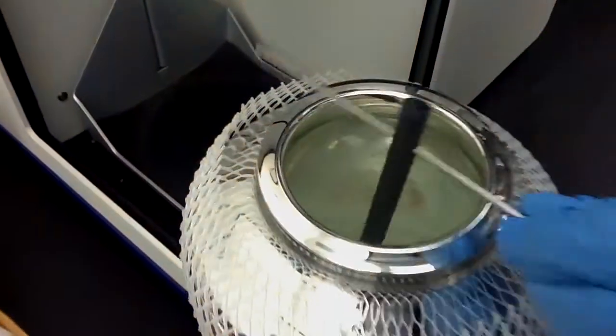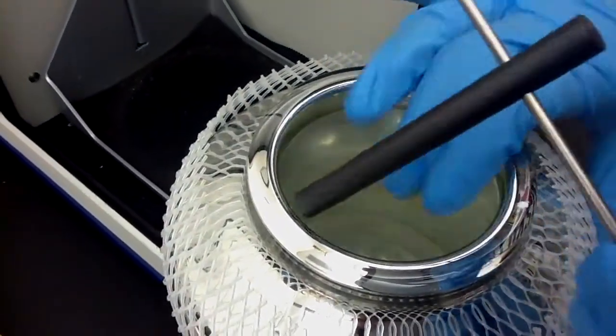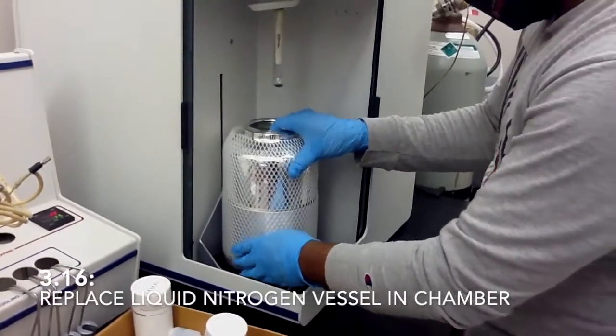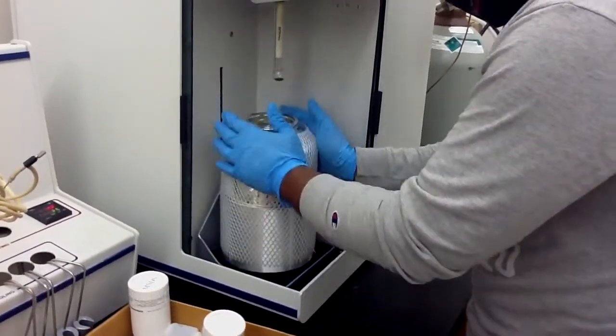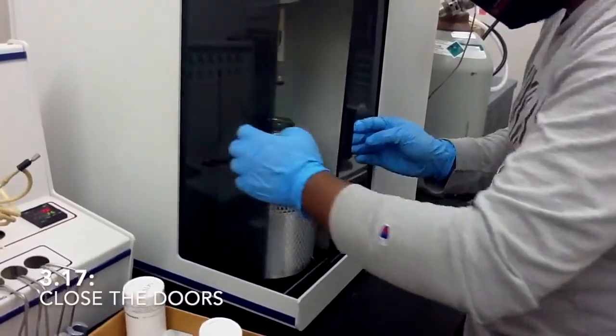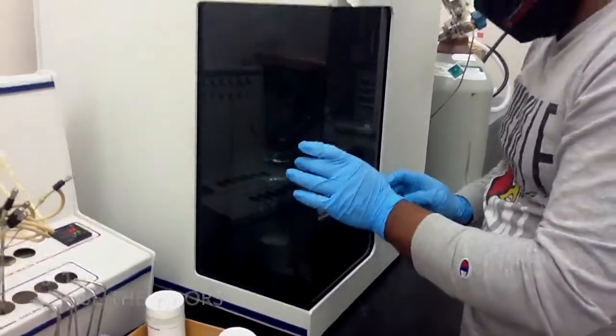So after putting liquid nitrogen here in this beaker, all you have to do is just put it here and just close the door.